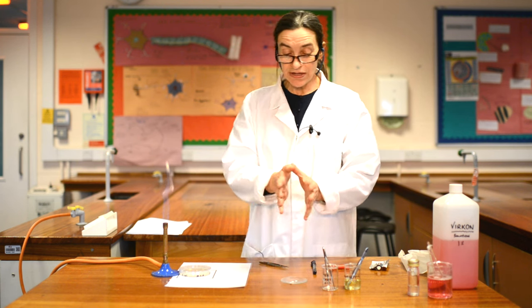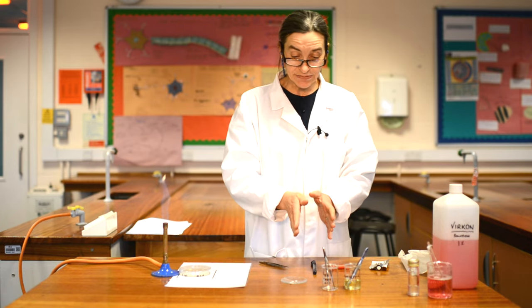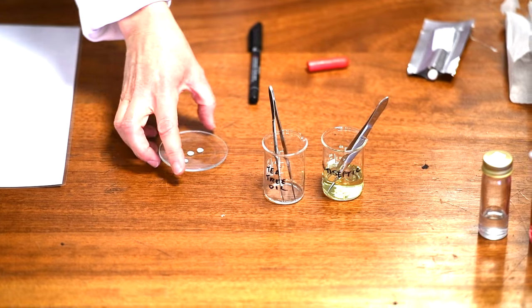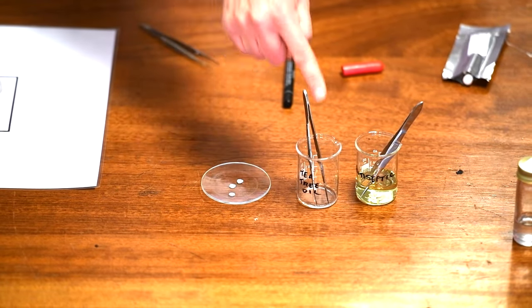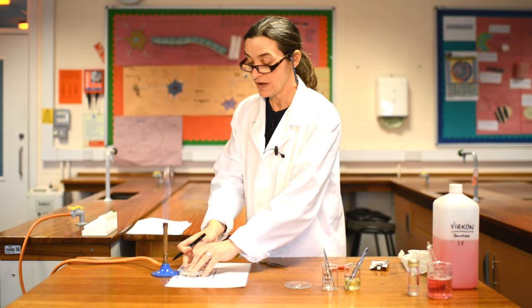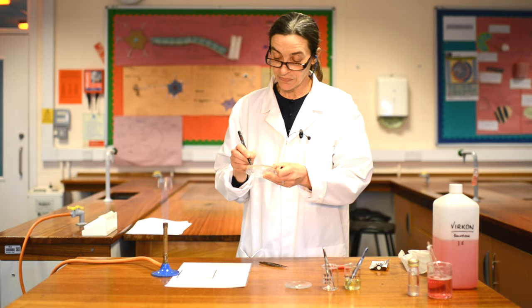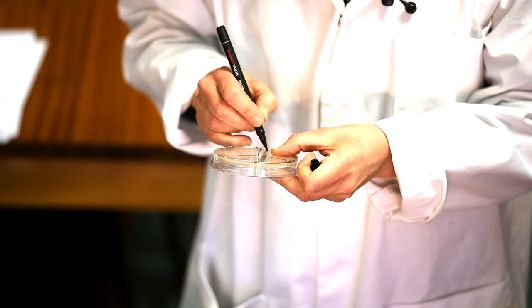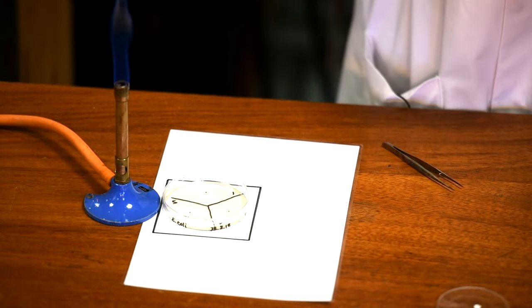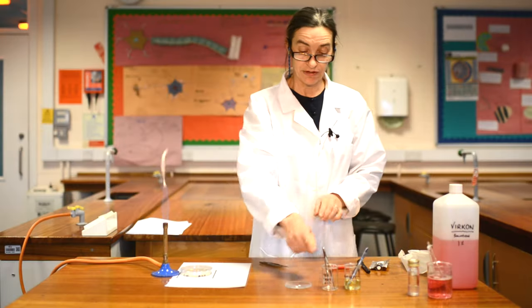We need to make sure that we are still sterile and we know which disc is which. I'm going to call these one, two, three. So on my plate, I'm going to pick it up without taking the lid off and write one, two, three so that I know where I'm going to put my little discs. One's going there, two's going there, three's going there.